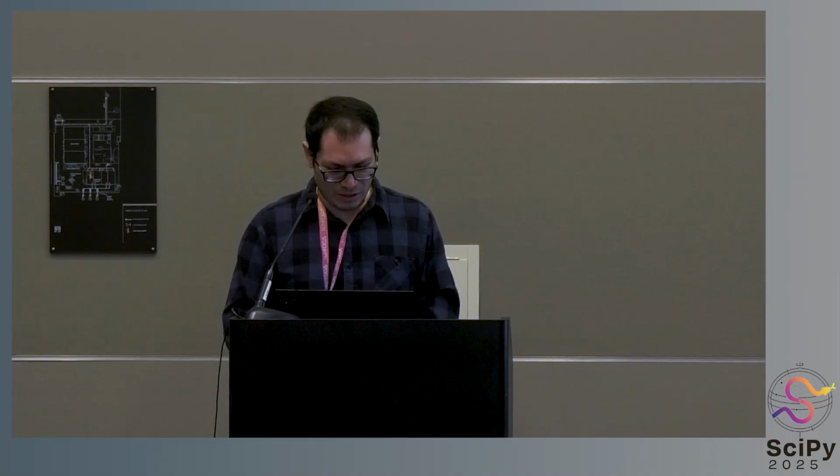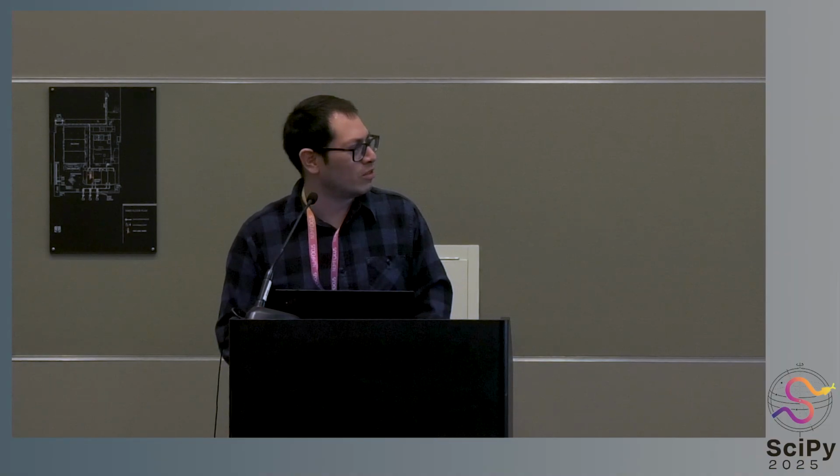I think that we can jump into the actual computation of this, because I know that because we are running on the GPU, even if it is the full image, it shouldn't take that much time. But I would like to show you that you can integrate this idea of applying the chunk inference process along with that mask that allows you to compute only on specific regions that you know contain something of interest. So if you remember, the image probably has a lot of background and white space that you don't want to waste time computing on, because you already know that there is nothing there. So we would rather compute on a masked version of that image.